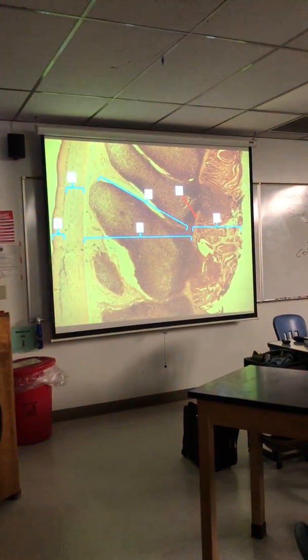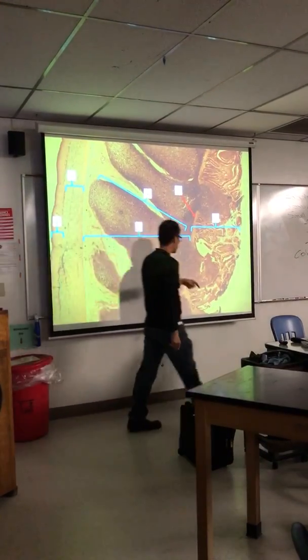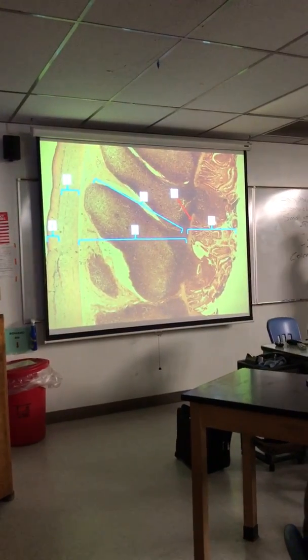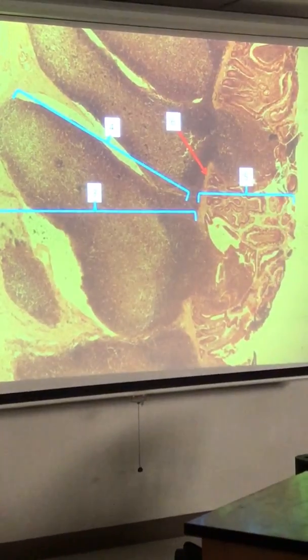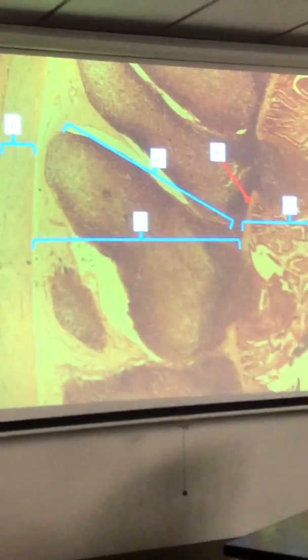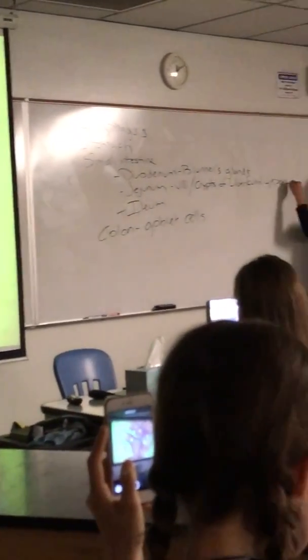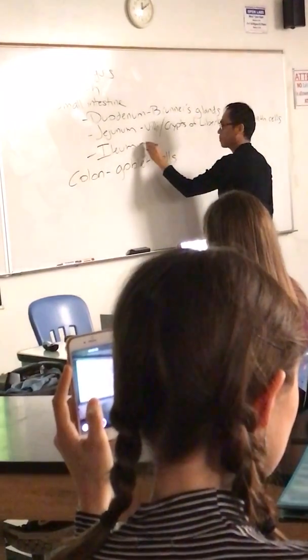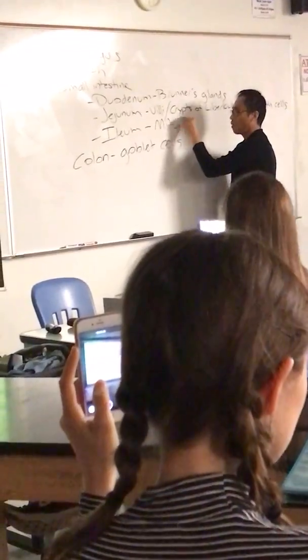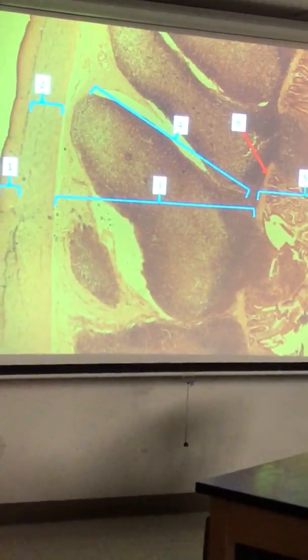The malt is number 4. That's how I know we're in ileum. So for jejunum, I would focus on the villi and crypts of Lieberkühn with Paneth cells. For ileum, the way you tell, look for malt. Number 4. I mean, it's pretty obvious, right? The big purple splotch is malt.